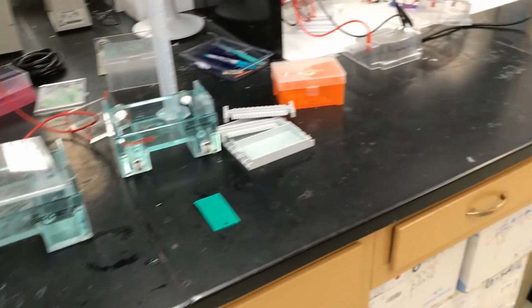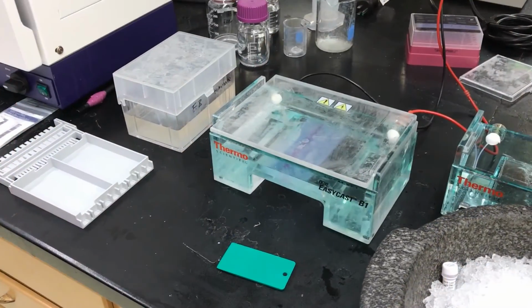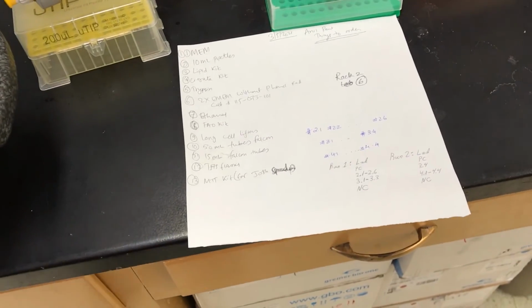Also to the right of us, we have the chemicals used for making Western transfer gels. Here's some footage from the next day of me working on a gel electrophoresis. You can't really see my samples all that well, but I have them in an ice bath. I also have the order of the ladder recorded on that sheet of paper there.